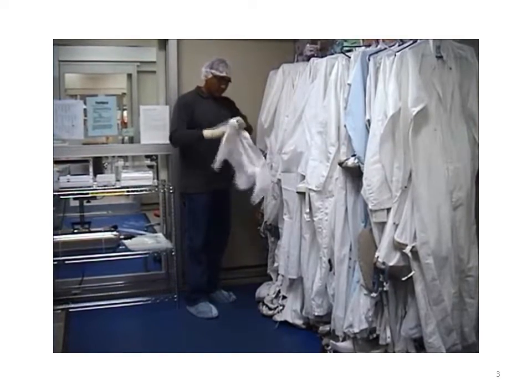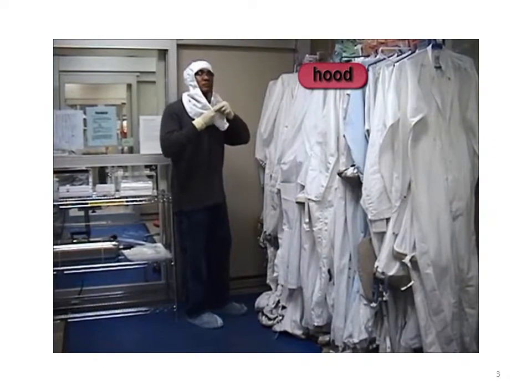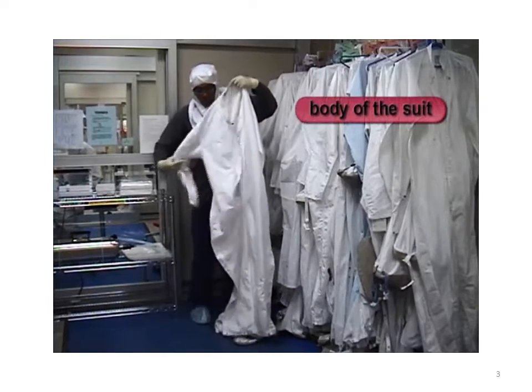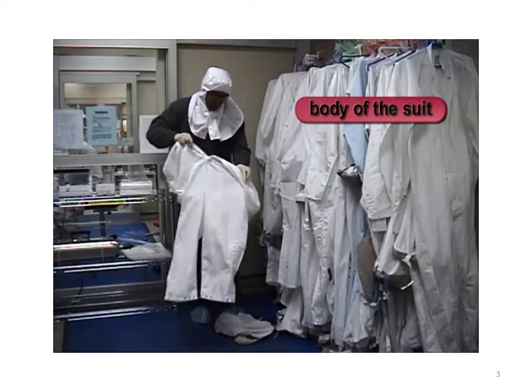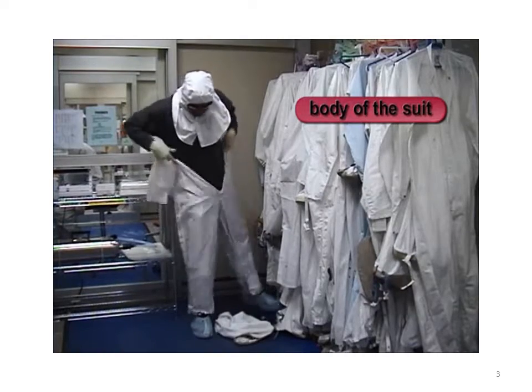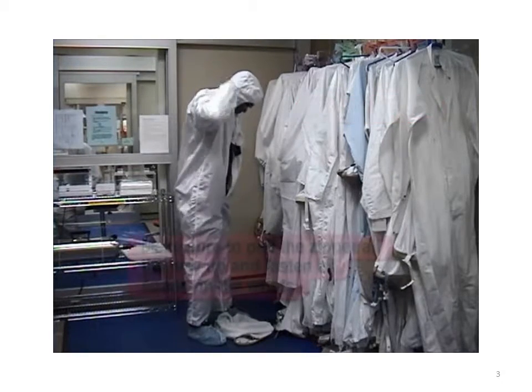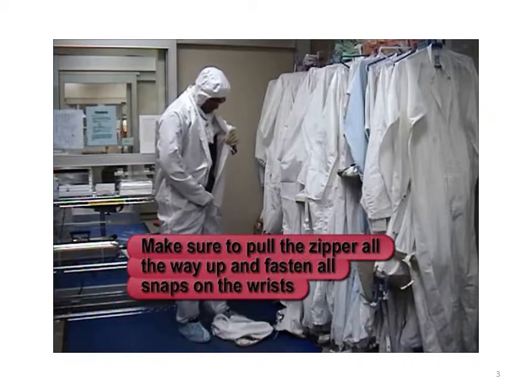When putting on the bunny suit, work from your head down to your feet, starting with the hood. Place the hood on your head and fasten the snaps under the neck. Next comes the body of the suit. While holding the sleeves and body to keep them from touching the floor, put on the suit. Make sure to pull the zippers all the way up and fasten all snaps at the wrists.